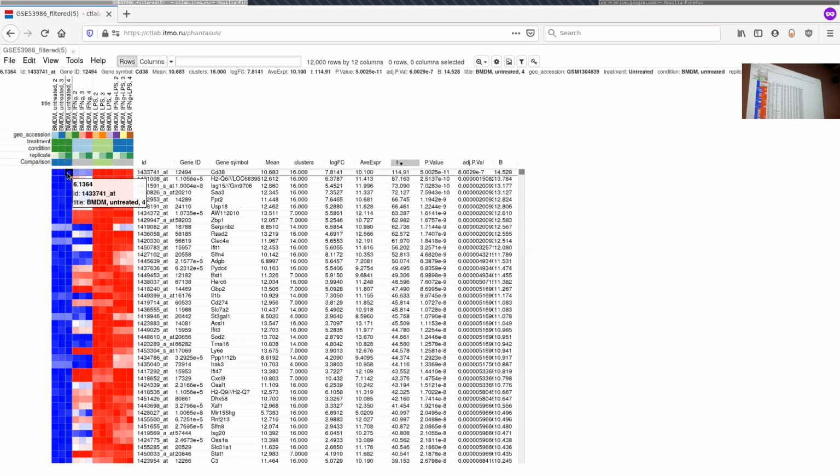Yeah, and there is some magic involved in that the variance is not estimated. Usually in a standard t-test, you estimate the variance based on one particular sample, but not a statistical sample.